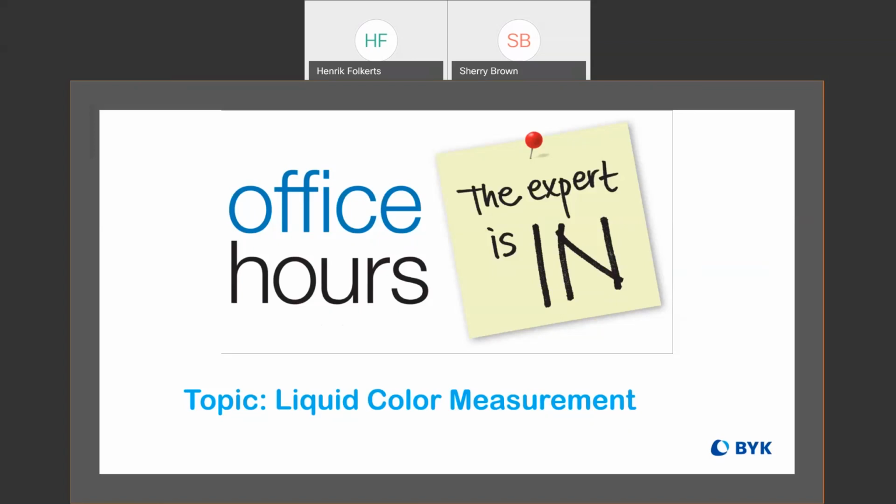Okay, thank you. Another question here that one of our regional sales reps gets quite often: is it okay to use deionized water instead of distilled water? No. So they're both very pure forms of water. It's actually somewhat common to think that you might be able to use deionized water in place of distilled water. But distilled water is more pure than deionized, and when calibrating the instruments, they're calibrated with distilled water, and it really does need to be distilled water because the instrument is sensitive enough to pick up the difference. And I've seen firsthand where calibrating with deionized water can throw off the measurement results.